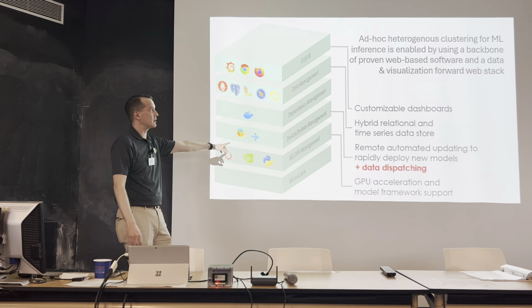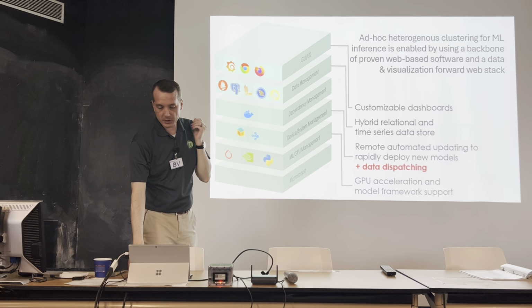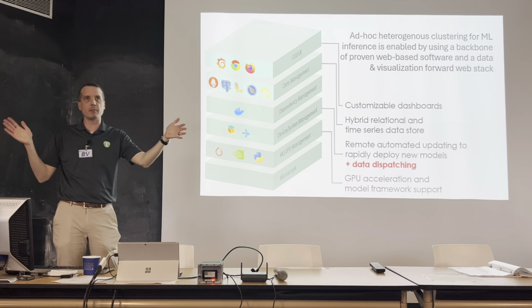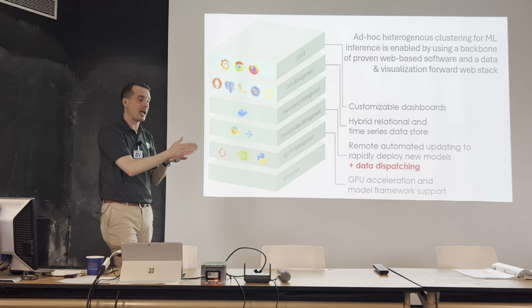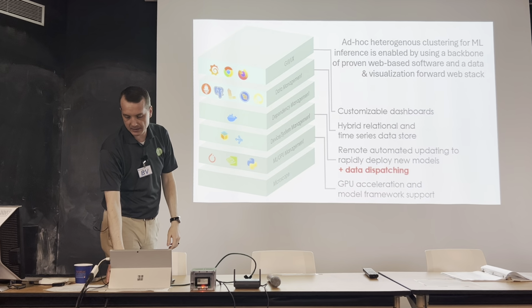But going back to that 3 model limit, what we said is, instead of having 3 separate or n number of separate acquisitions, we should have one acquisition governed by a head node, which dispatches or broadcasts that image to the rest of the nodes.